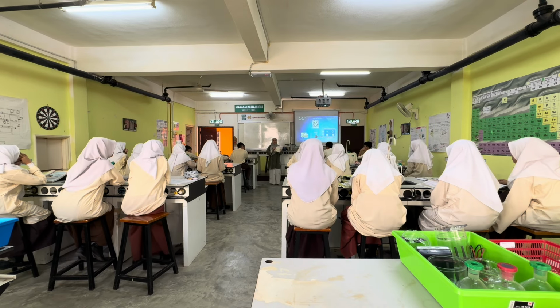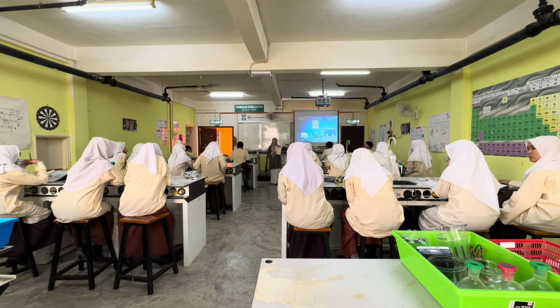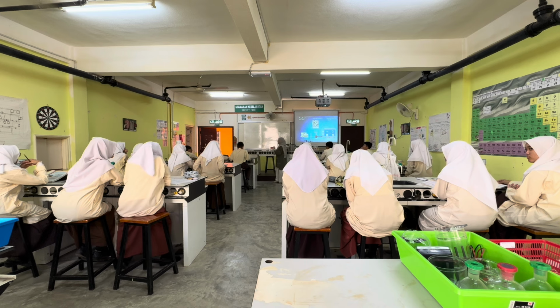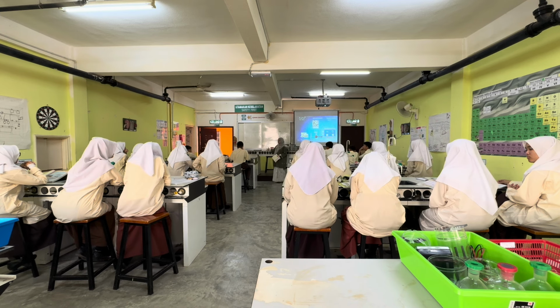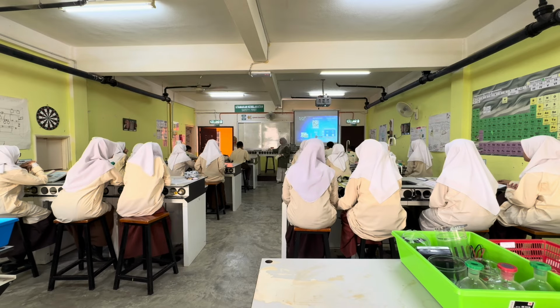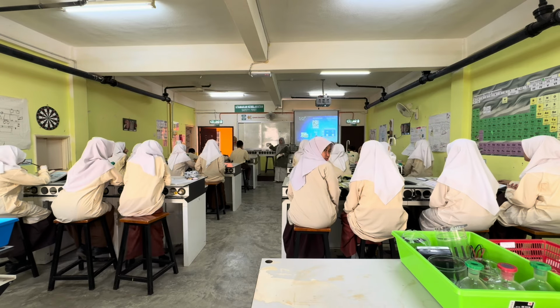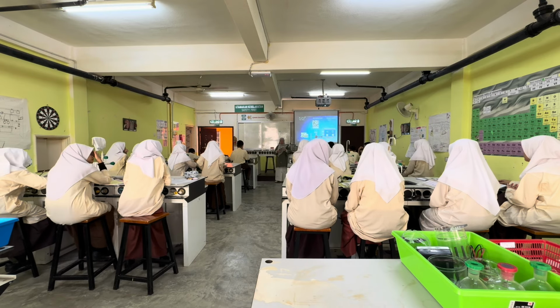For example, experiment 1, temperature of the solvent. You take one spatula of salt. Okay? Which salt do you need to use? Is it a fine salt or the huge one? Fine. Okay, you use the fine salt. Fine salt, one spatula. Good job.